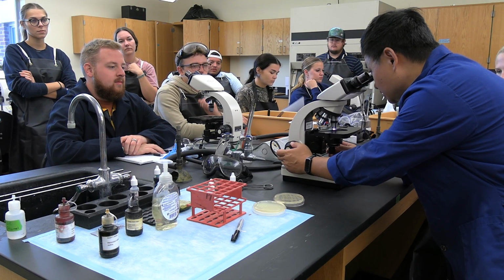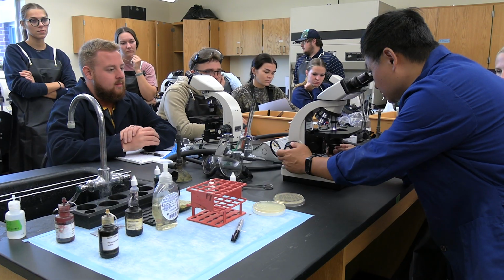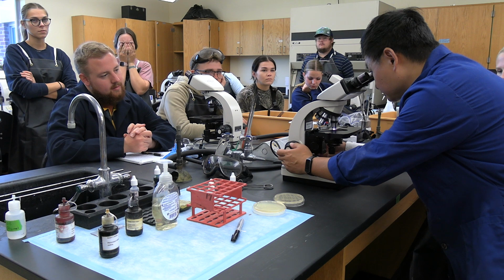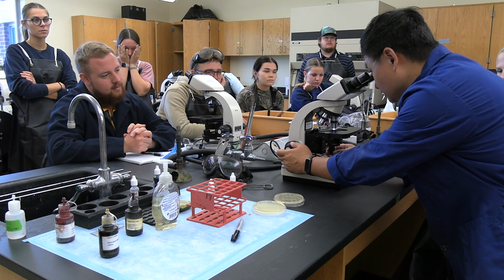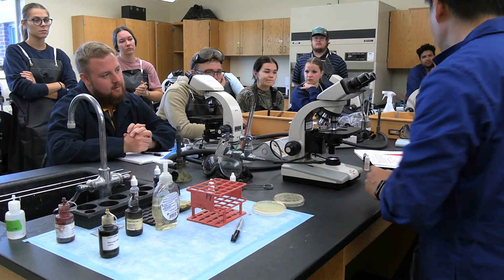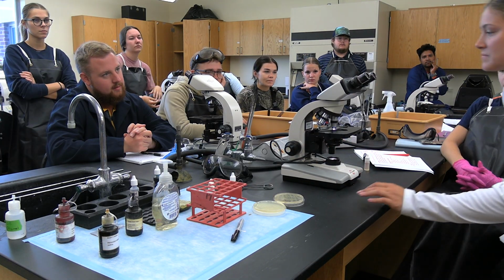But obviously it looks like it's a mixed culture. I think that this Salmonella, this E. coli may be mixed with something. So we'll see what it looks like. I don't know. So go ahead and see it. It's E. coli, what it looks like.